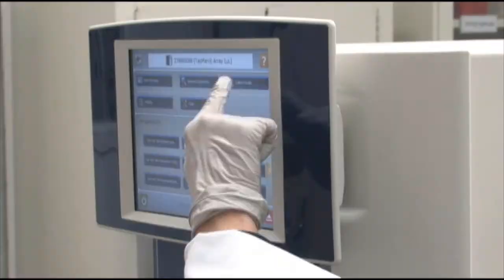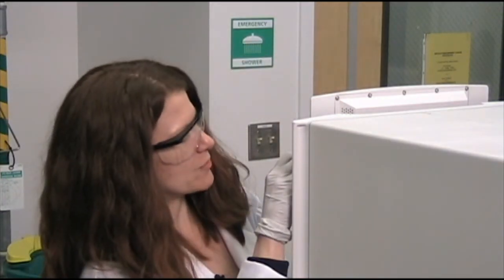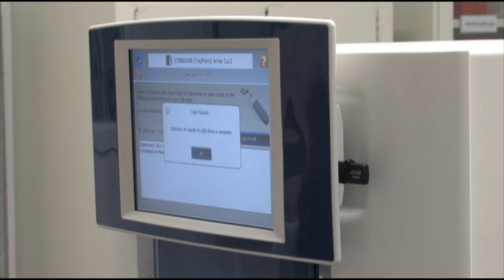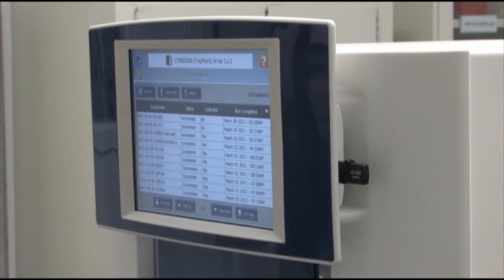My TaqMan Array card experiment is done. I'm ready to collect results, so I hit the collect results tab. I insert my USB into the USB drive. I'm copying the results — it says please do not remove the USB drive. Collection is complete. I hit OK, remove my drive, and off to my computer to analyze the results.